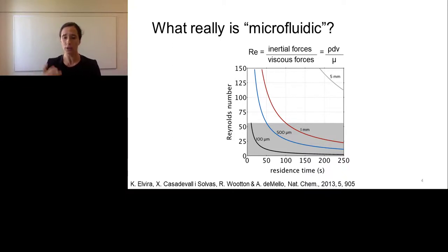And then we know this, and we know that that's fine, but we also know that the characteristics of microfluidic flow are perhaps not always found in all of the microfluidic literature that you find out there. So what we wanted to do is say, okay, what does the microfluidic research community define as microfluidic, and how does that balance with what we know about fluid flow on that scale? So that graph that you can see down there is us doing a virtual experiment, if you want.